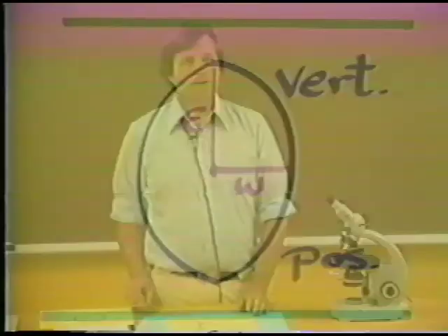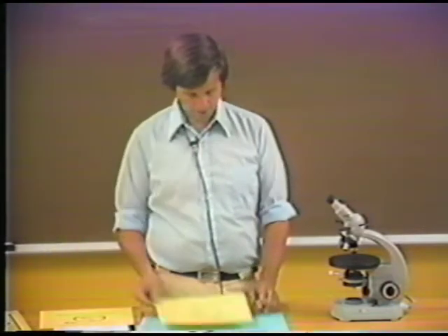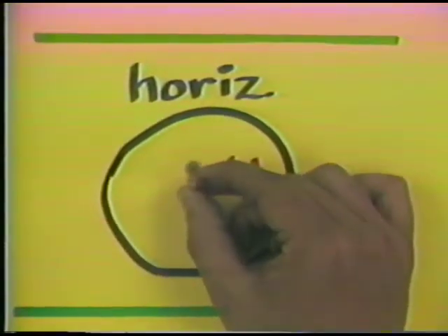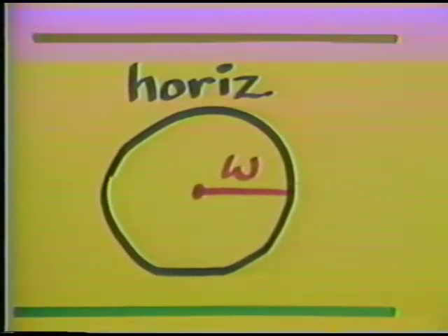Well, the other opposite kind of section that we have of the indicatrix is a horizontal section. The horizontal section of the uniaxial indicatrix is much simpler. It's a simple circle specified by one radius, omega. And remember that in this orientation, the horizontal section, the C-axis is perfectly perpendicular to this side of the figure. That is, it's exactly perpendicular to the stage if the mineral grain can be oriented in this kind of orientation. Well, that takes care of a positive uniaxial mineral.